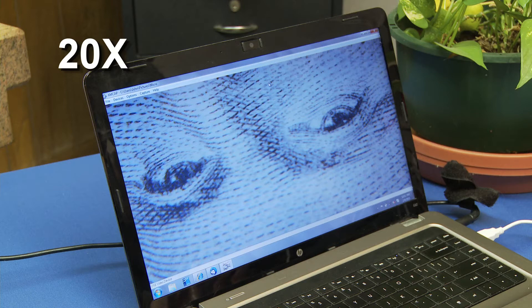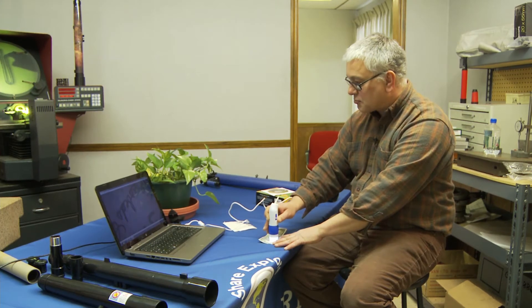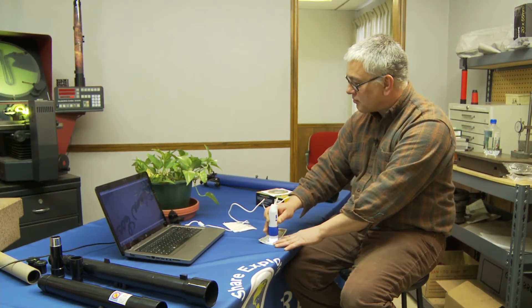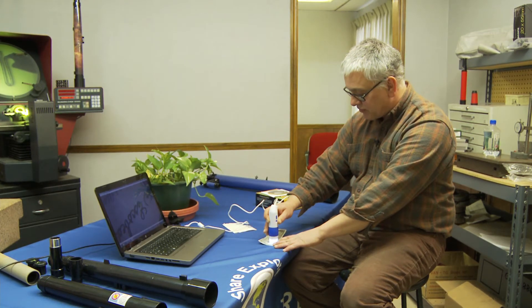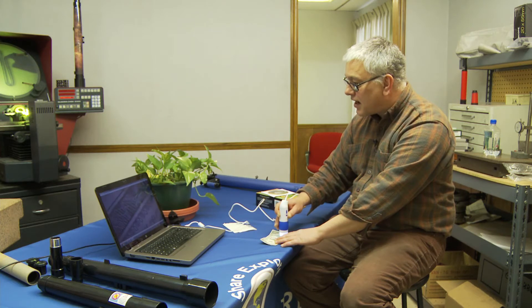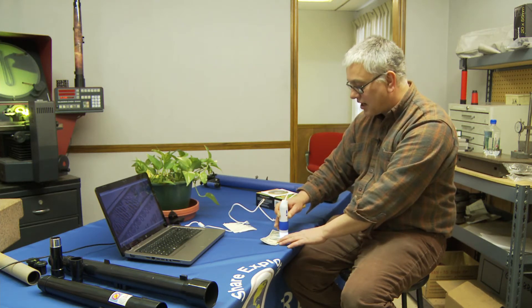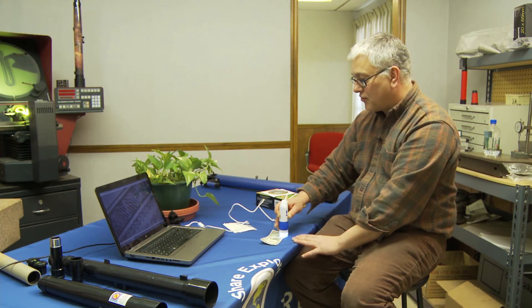Now this is George Washington's eyes, of course. And I'm going to go over to some of the smaller things on the dollar bill here. There's some literature down here that's very small and very hard to read. And if you kind of go to the outside edge here, it looks just like a pattern when you look at it with your naked eye.